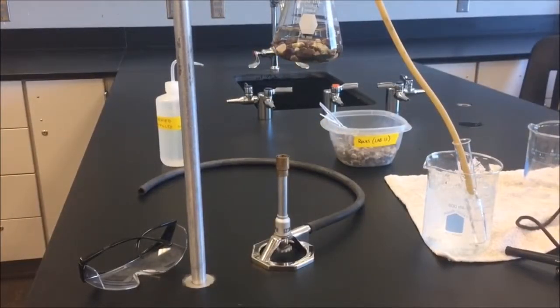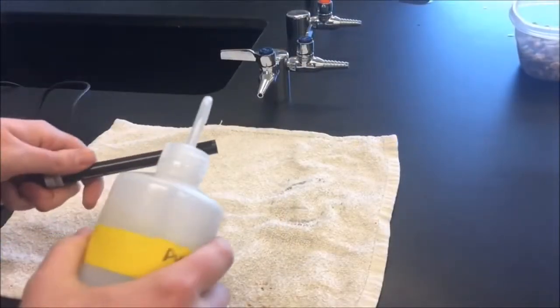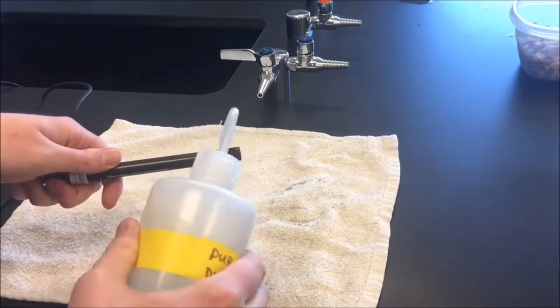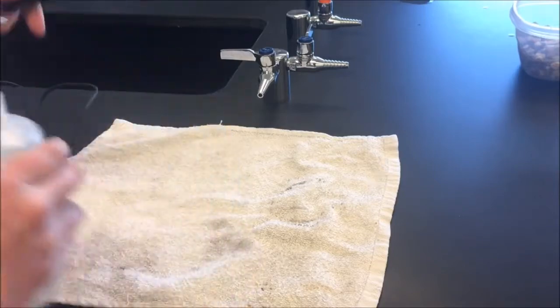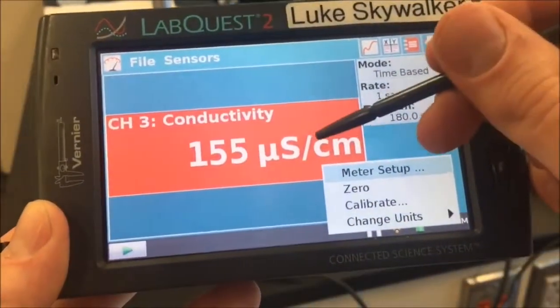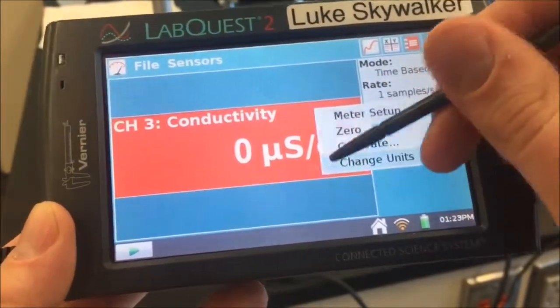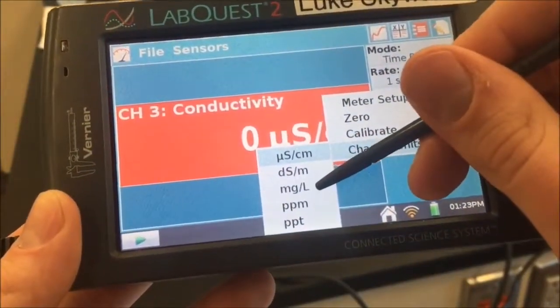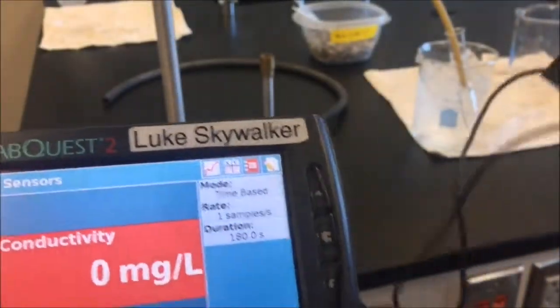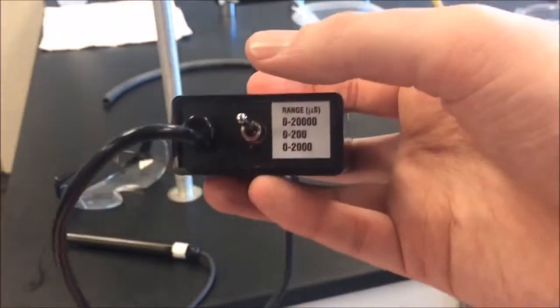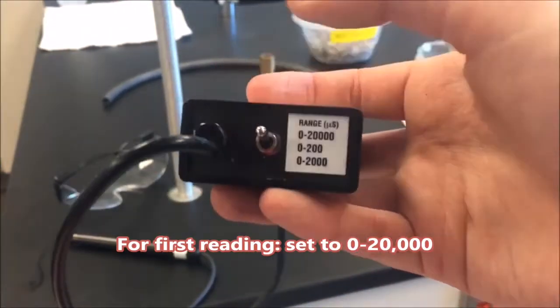Before we run the procedure, the first thing we need to do is measure how much salt is actually in the water. So what we're going to do first is plug our conductivity probe into the LabQuest device. Spray off your conductivity probe with distilled water. Before we take our measurement, we're going to make sure to change our units to milligrams per liter. And on the conductivity sensor, we want to make sure that we have it set to 0 to 20,000 initially.